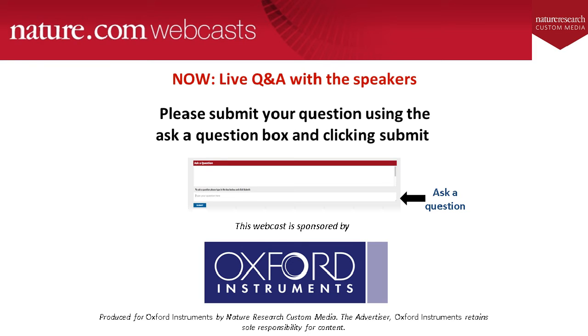They're less likely to be affected by the preparation. So I'm not sure if it depends on the weight of the element as much as where it is and how it's immobilized in the sample.